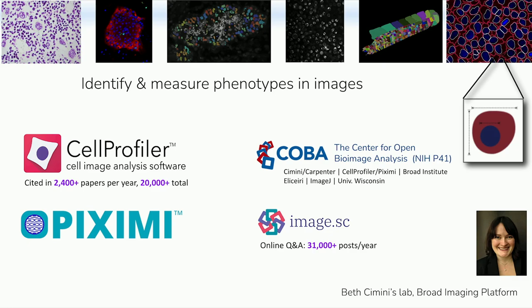I want to point out Beth Cimini's lab is my sister lab at the Broad Imaging Platform, and she's leading now the CellProfiler project, as well as Piximi, which is a web browser-based deep learning focused phenotype classifier, and also doing all kinds of other image analysis tasks. Maybe the most important thing I could say today for those of you working on image analysis problems is, if you're ever stuck on anything, be sure to go check out image.sc. Image Scientific Community is what it stands for.